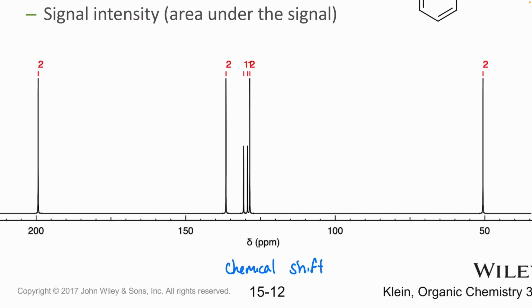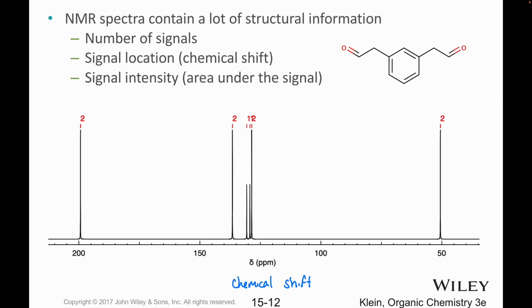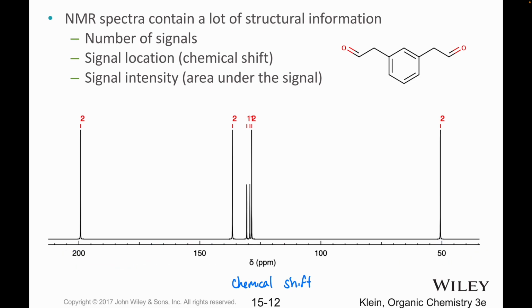Let's take a look at just an NMR spectrum here. What does this look like? This is the kind of graph that you would expect to see from NMR. We have an x-axis here of chemical shift values. These are very similar to a frequency, like what we saw in our IR spectra. It tells you the different chemical shift that you're sending in. And we see we got these peaks here. Boom, boom, boom.